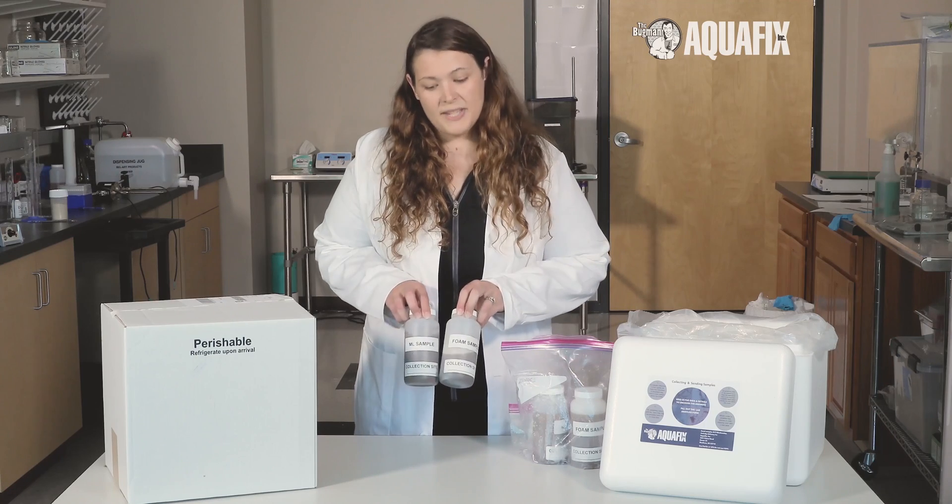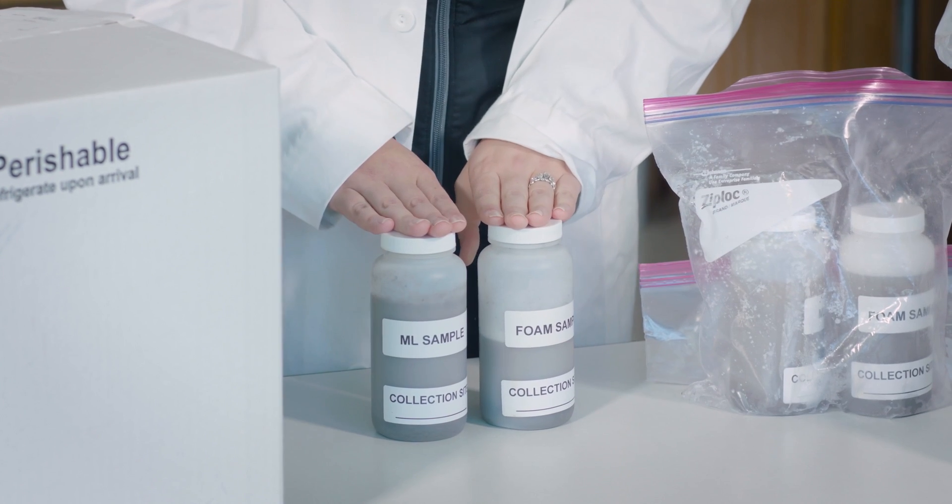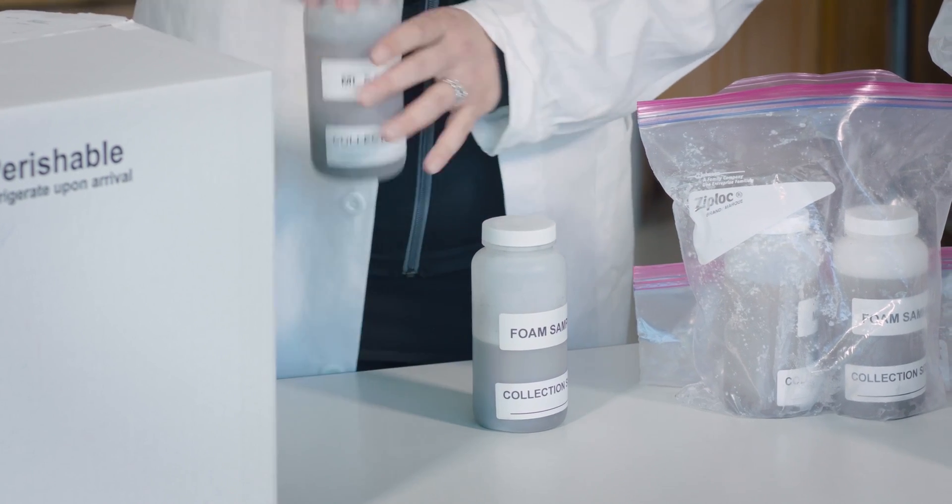Collect your mixed liquor and foam samples in the provided bottles, making sure to fill sample bottles three quarters full. It is important to leave an air space.